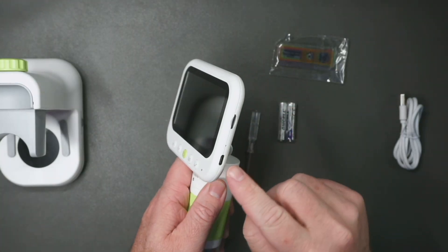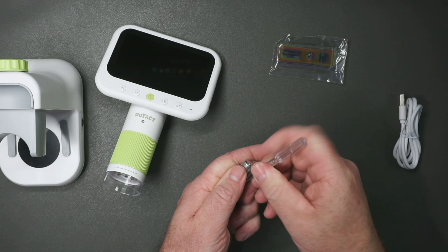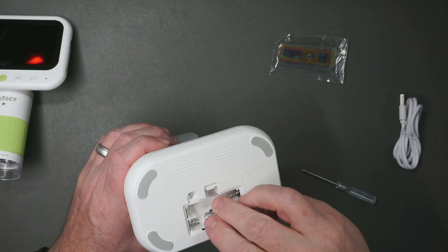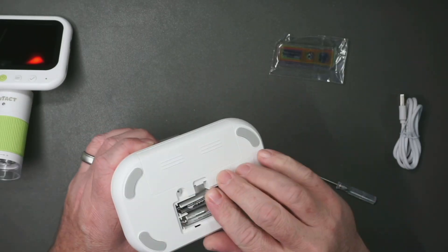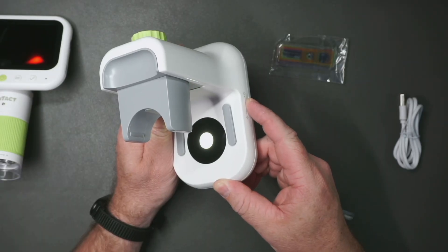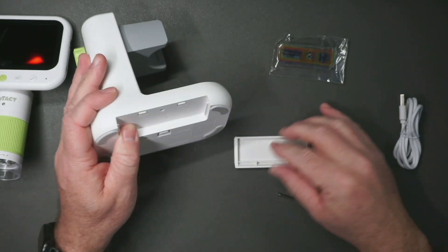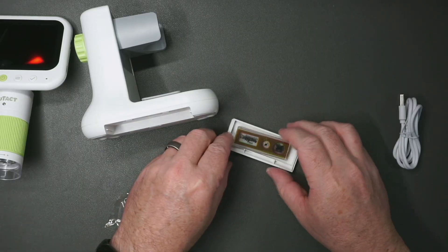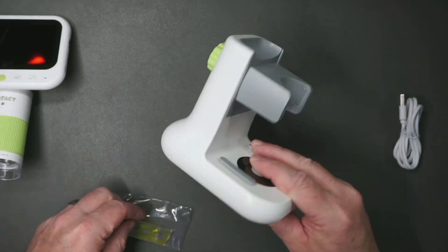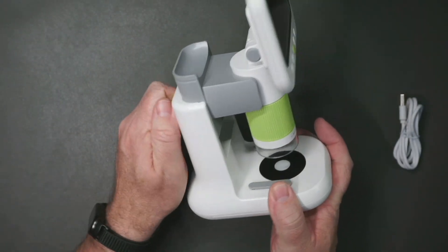You can insert the TF card in the side here, and also plug in a USB cable here to charge the battery. The batteries here are for the base of the microscope, which you don't have to use but you can — the reason you'd want the batteries is just for the LED light. Now that the batteries are in, we can twist the knob, though it's not very sensitive — basically off or on. It also has a slot here for these slides. Let's put those in. They all fit but one. The microscope snaps into where those grooves are, and then you can raise or lower it.